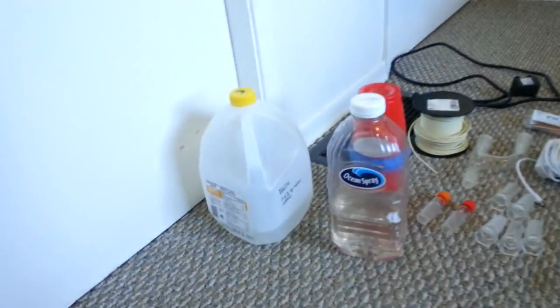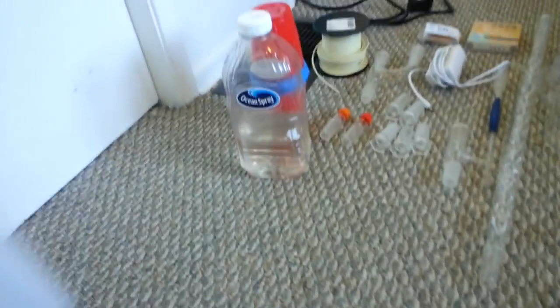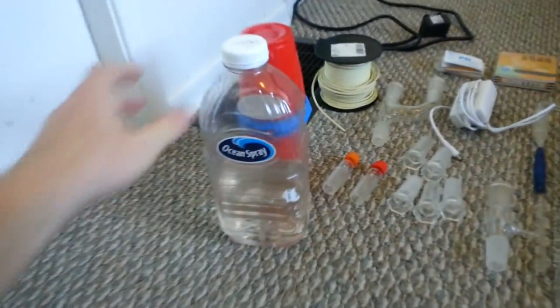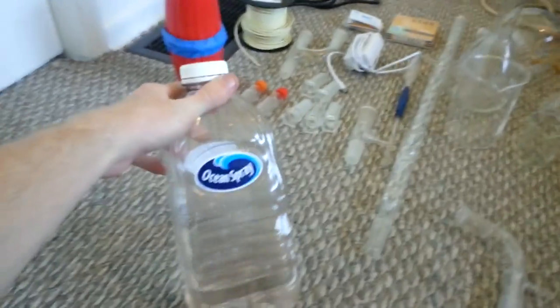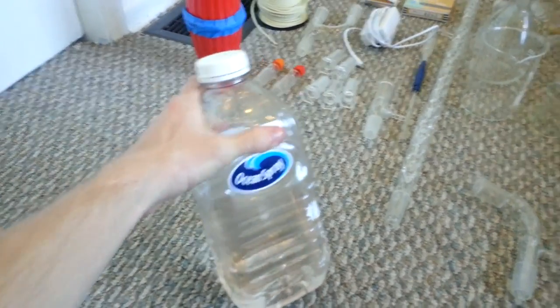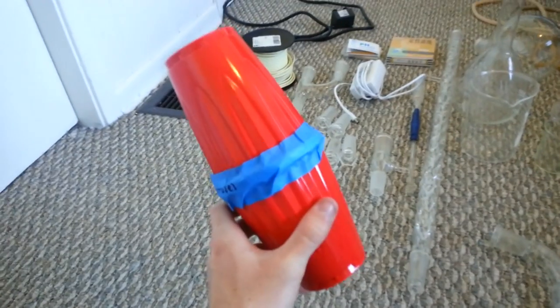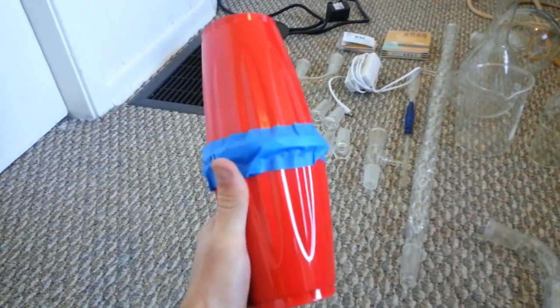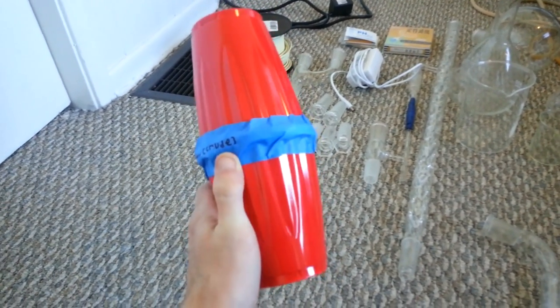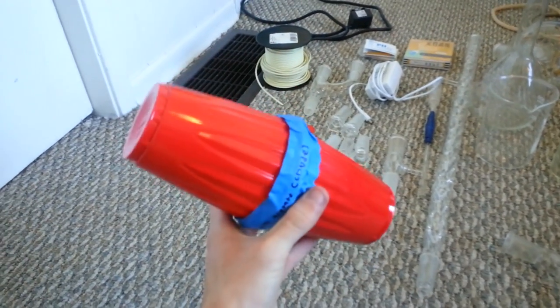You need some storage containers. I just MacGyver it and use empty milk jugs or empty juice containers. They tend not to react with things, but you should check and make sure that none of the things you're storing in them react with the plastic, because that would lead to a mess. Also, if you're storing powders, you can use solo cups — you can get 200 for like $15. Just take two of them, tape them together, and they work.